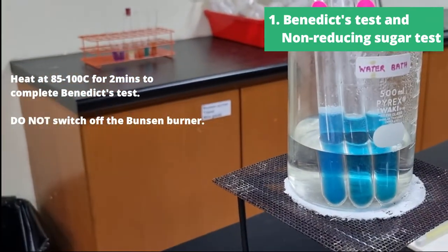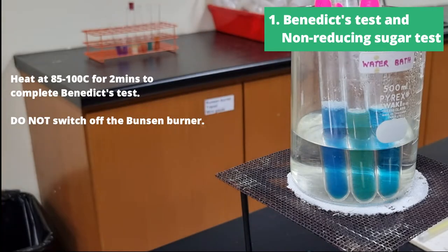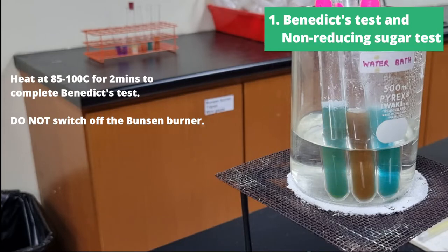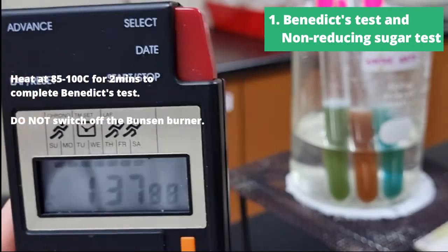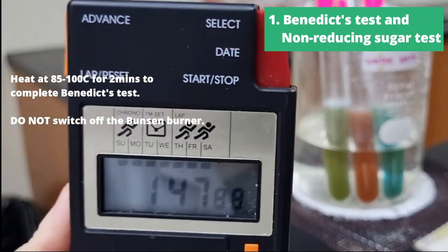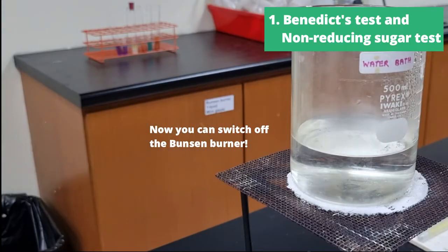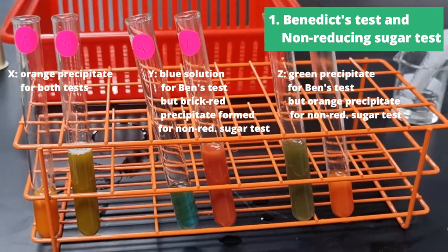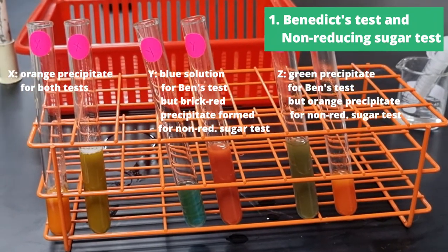Then we're going to complete the Benedict's test by heating the test tubes for two minutes. Do not switch the Bunsen burner off throughout until the test is complete. After completing both reducing sugar and non-reducing sugar tests, these are our results.